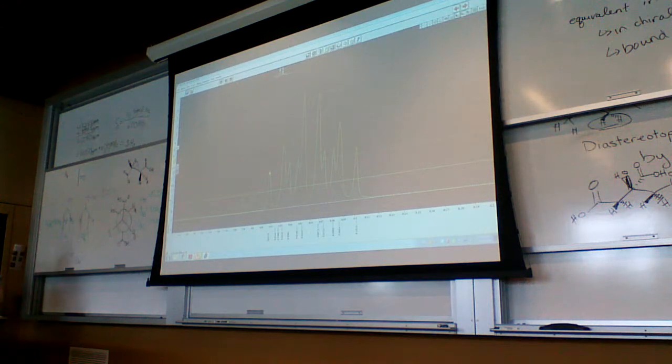It's more common than you would expect that second value to be like 14. If they were overlapping, it would be exactly double, right? So let's look at what the next one is. It's pretty close to double, but it's not quite there. And this one, what do we have, 17.06.